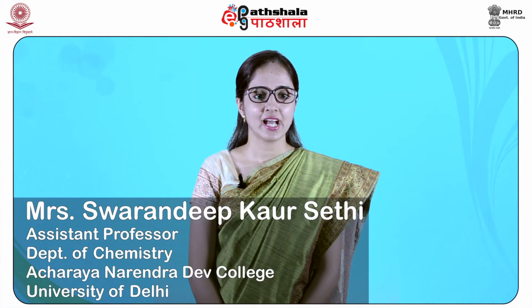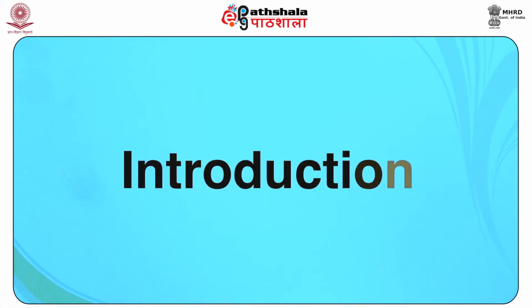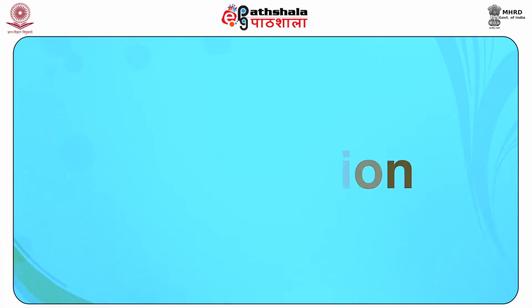Dear students, after studying this module, you shall be able to understand the concept of infrared spectroscopy and predict the number of fundamental modes of vibration of a molecule. The most frequent spectroscopic technique used by organic and inorganic chemists is IR spectroscopy, or infrared spectroscopy. It deals with the absorption of radiation in the infrared region of the electromagnetic spectrum.